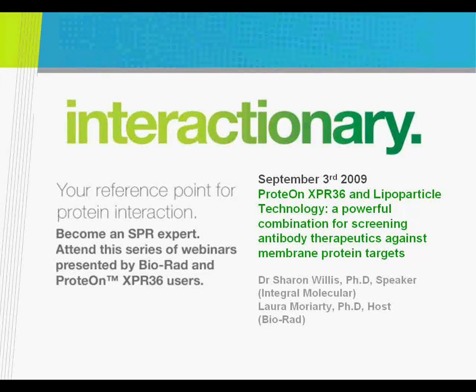So you've got to appreciate that even though the concept is similar, whether you immobilize on an ELISA plate or couple it to a chip, the protein could be different. So if you select your antibody against that protein on ELISA, there is a chance that it won't bind in solution.